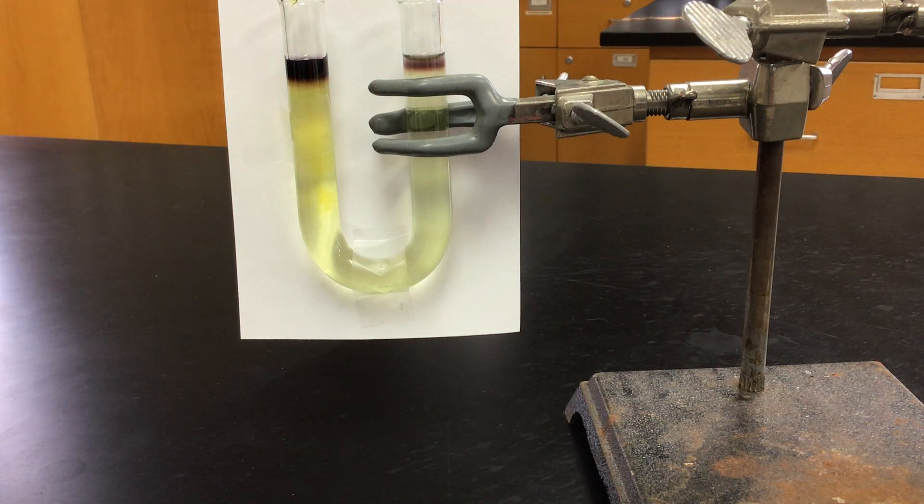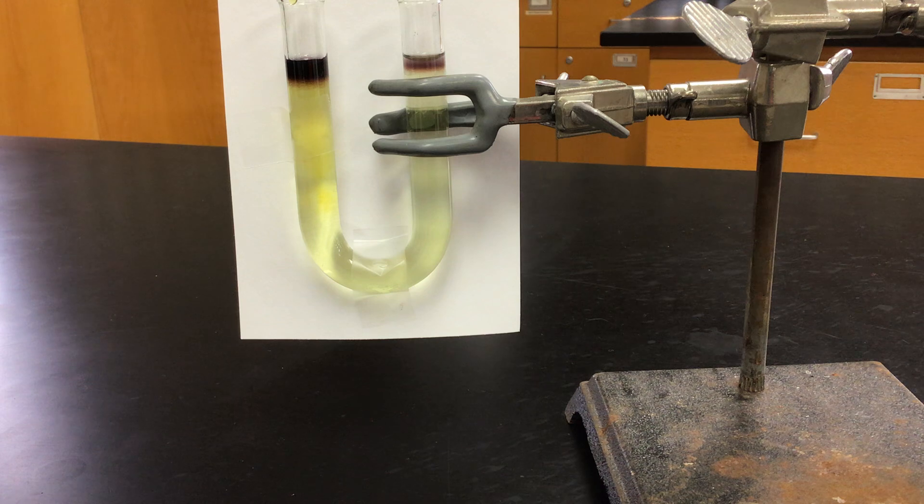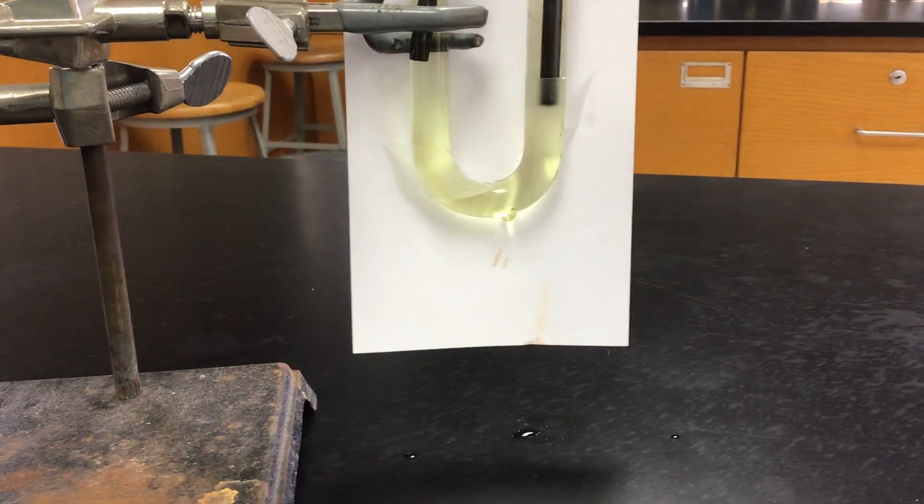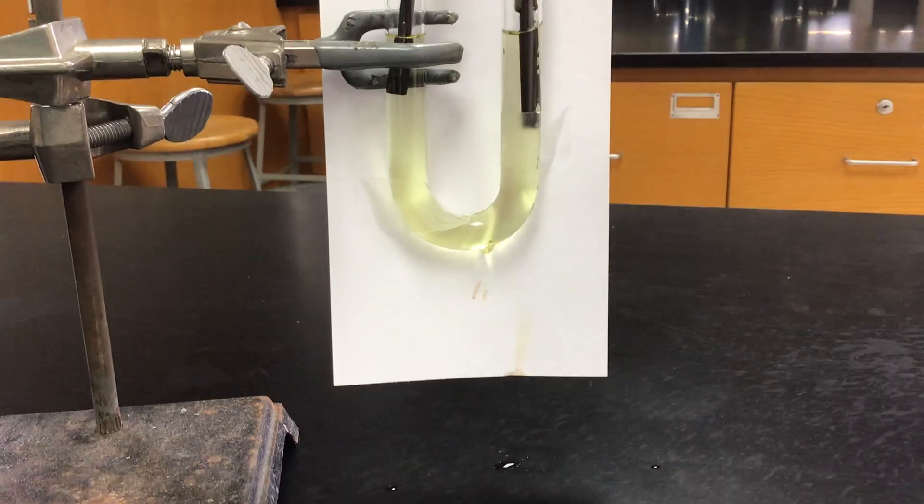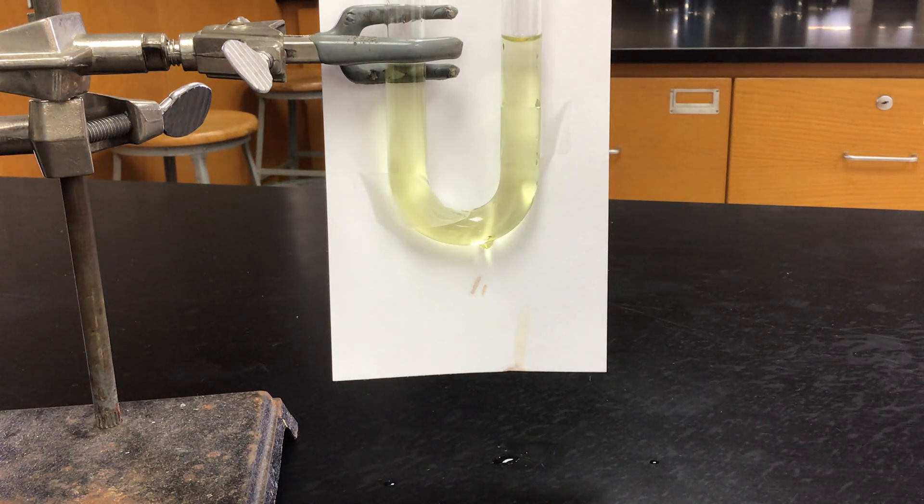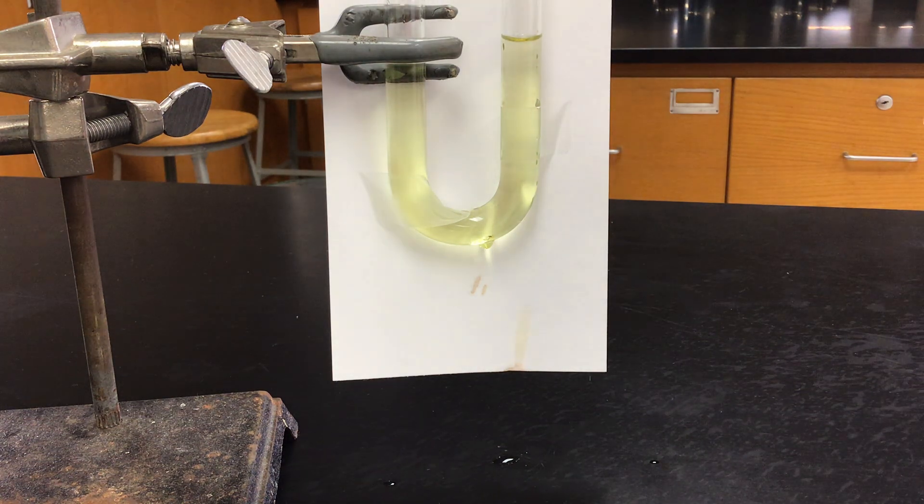For the second part of this, we're going to be testing the pH. And so for that, I've got some universal indicator that I'm going to add to the other U-tube that's been reacting over here while we were testing the other U-tube. I'm going to scooch this over. We've got our other U-tube here.